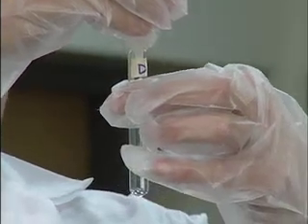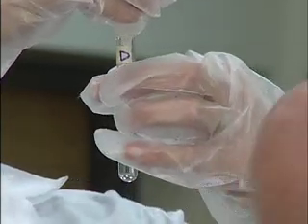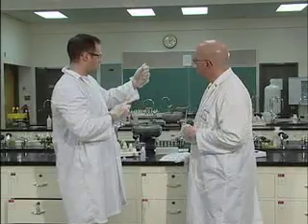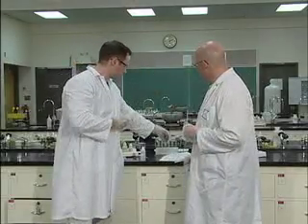Oh, look at that. White precipitate? It's going to disappoint me. I added too much acid the first time. Added too much acid. Yeah. Oh, well. That's too bad.